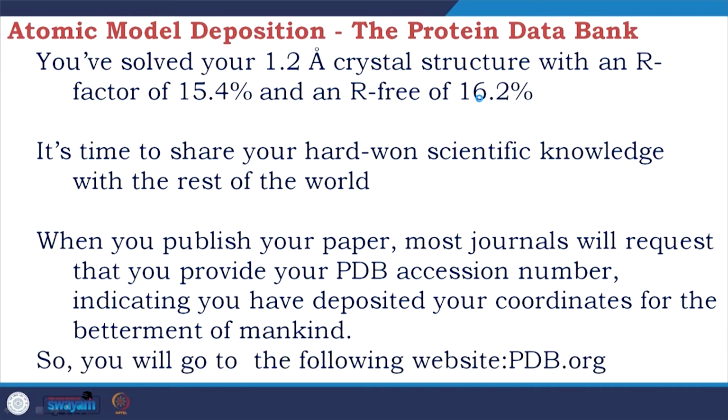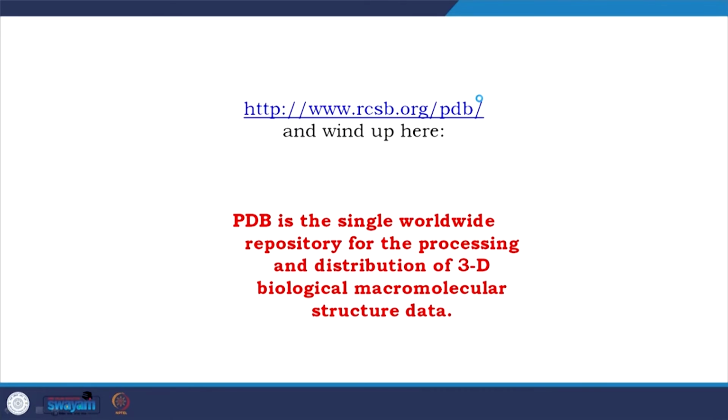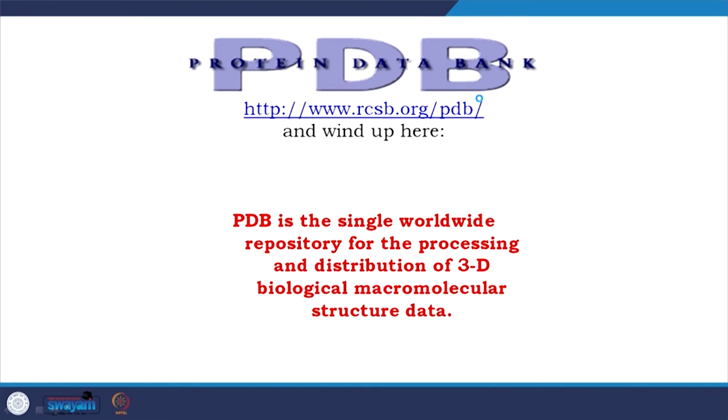Then you go to the following website pdb.org, we will talk about. So, this is protein data bank, and PDB is the single worldwide repository for the processing and distribution of 3D biological macromolecular structure data.